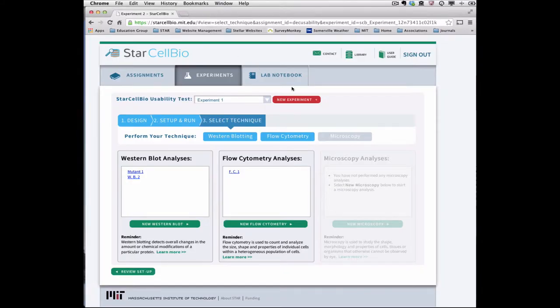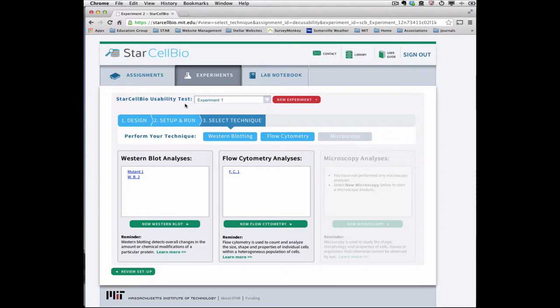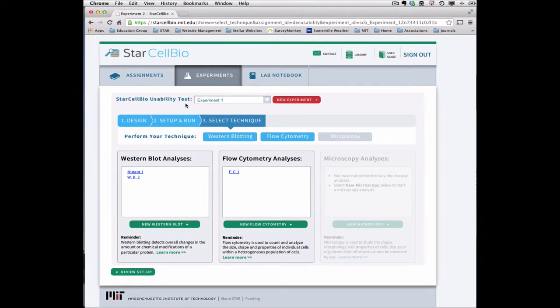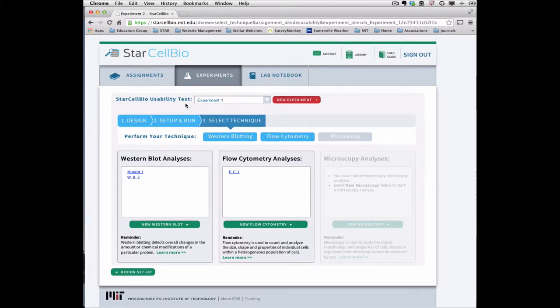Flow cytometry is a technique to count and analyze the size, shape, and properties of individual cells within a population of cells. We will use the same assignment and experiment setup as in video tutorial 2, in which we explored the StarCellBio user interface by performing an experiment that used the Western blotting experimental technique.